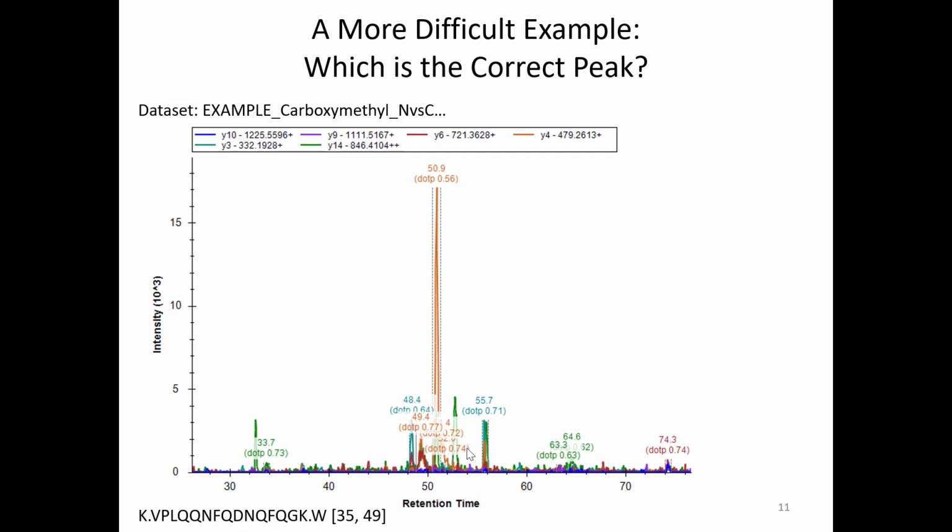So these are just some more examples. I think I deleted out which one Skyline would pick from here, but you know which is the proper peak, and we've been through a few examples, so I'm not going to spend a ton of time on it.